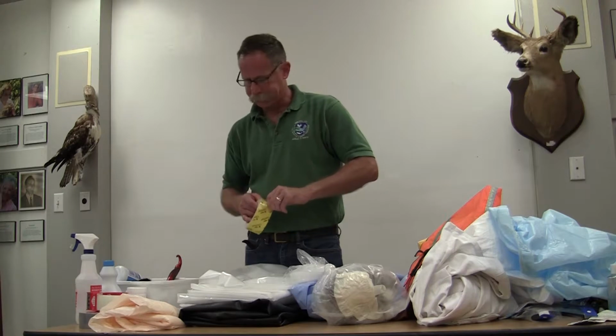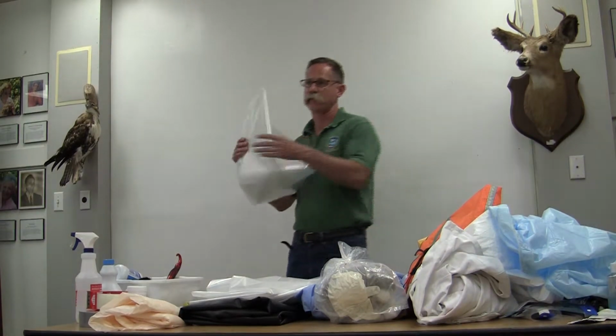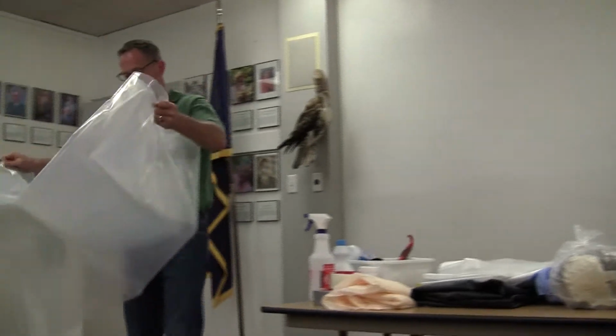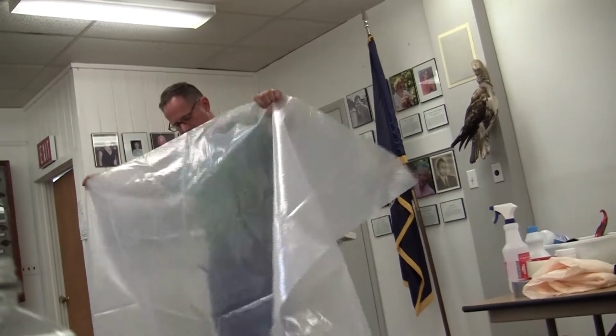We've got different size bags. We've got these really large bags here that we use for deer. This is a 4 by 8 bag, 6 mil. You can put a whole deer carcass in here. It's generally a 2-person job. I've done it myself once. It's very tricky and harder than it sounds.